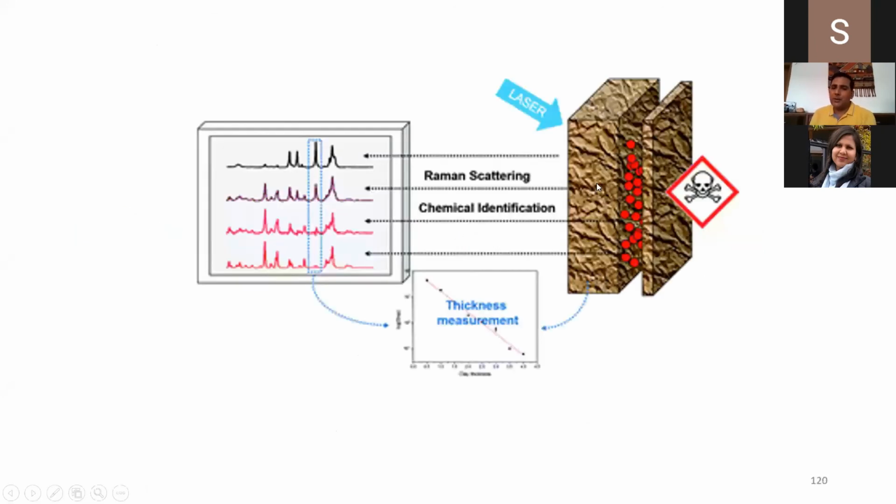And then after that, you will have a depth profiling of, let's say, your chocolate or any food material or any sample of engineering application, or you want to check the safety of a container. You want to find a crack also, how big the crack is, how much purity at each and every thickness. So you can do the depth-based analysis here, and by finding a change in intensities of the sample, if the intensity is changing at each and every depth, it means your composition is not uniform for that particular sample.